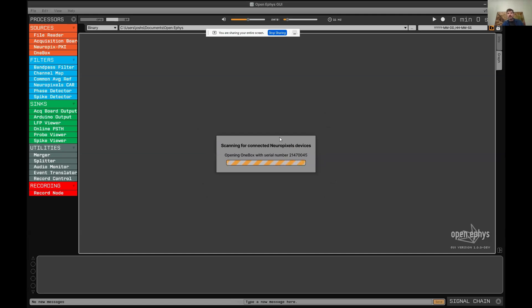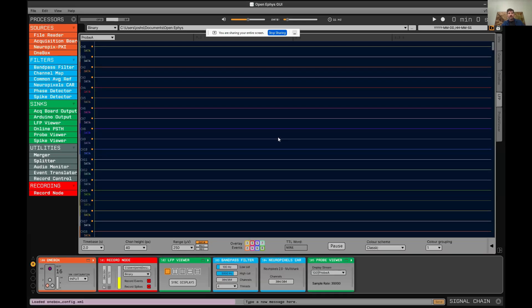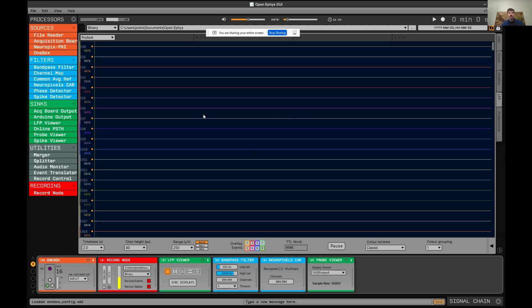It's now connecting to the OneBox that's attached to this computer via USB, and it will detect all the connected probes automatically and create a little user interface here. Before I dive into the Neuropixels configuration, I just want to give a quick tour of the overall user interface.